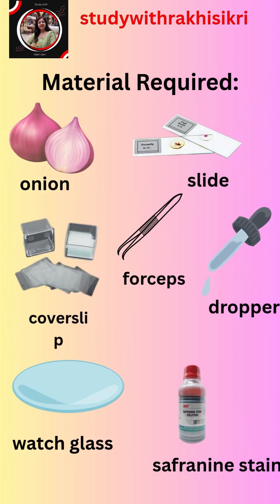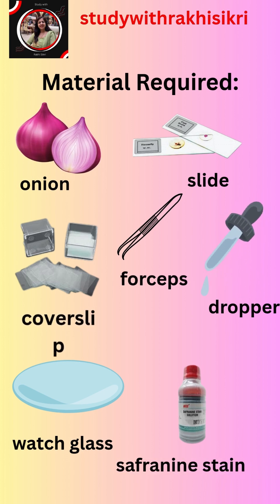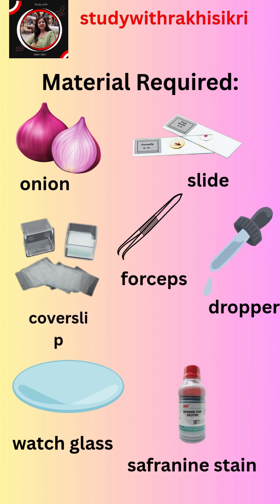We will require the following material: onion, slides, cover slip, forcep, dropper, watch glass, and saffronin solution.